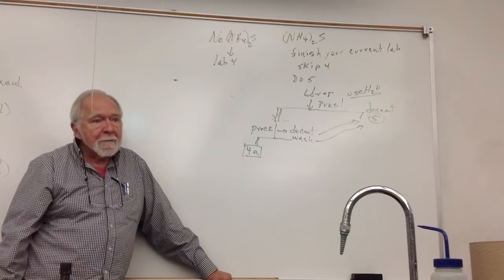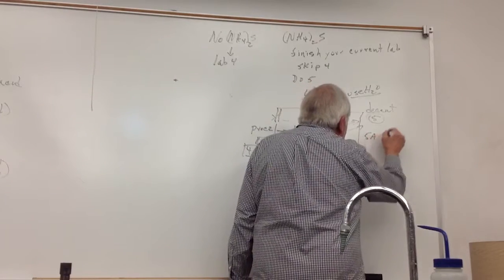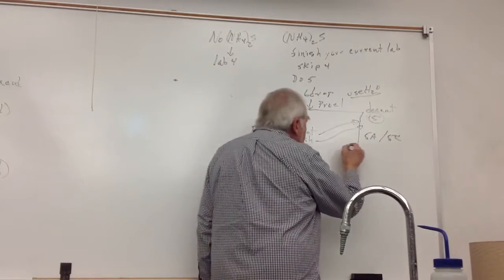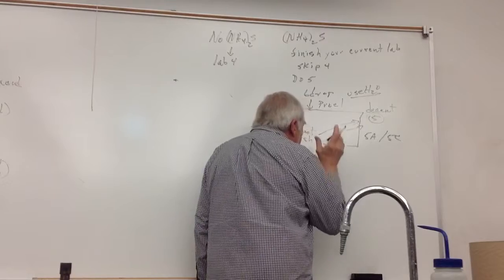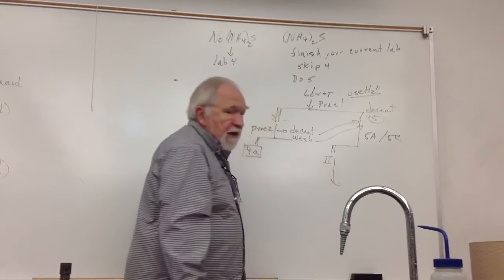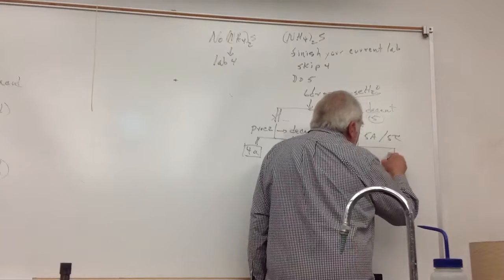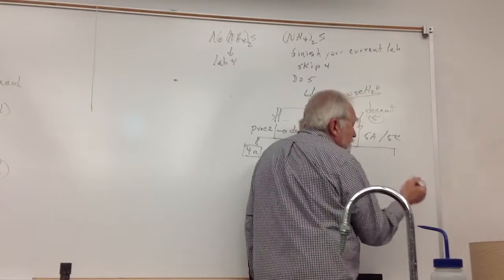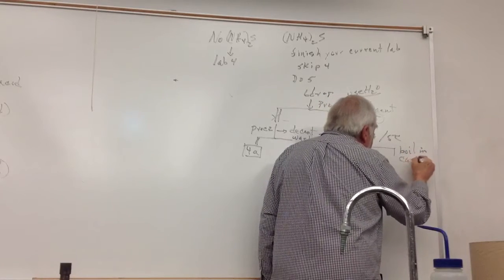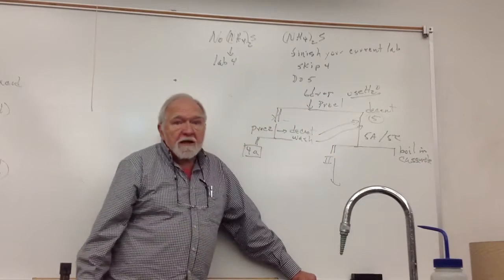Okay. Then you start procedure 5, which you're all familiar with. If you get a lot of precipitate here, continue. If you only get a few grains of precipitate, as you finish 5C, it says put in the casserole and boil. So when you finish 5C, you're boiling in the casserole.